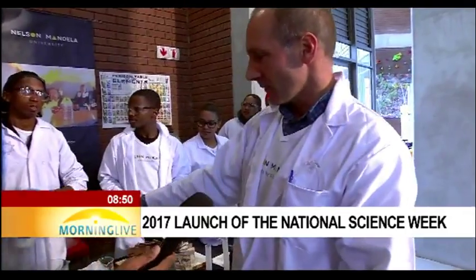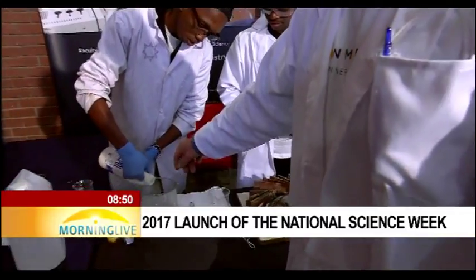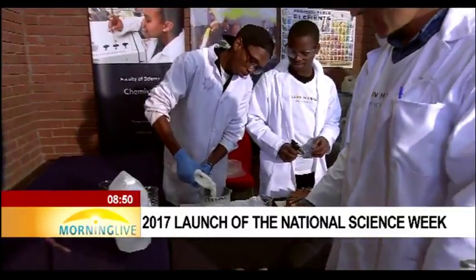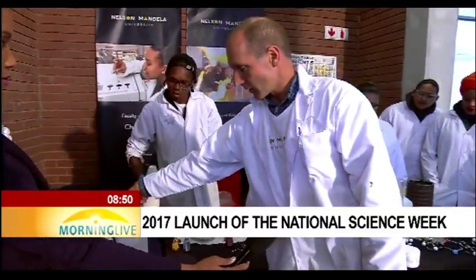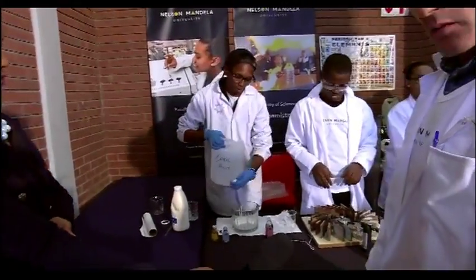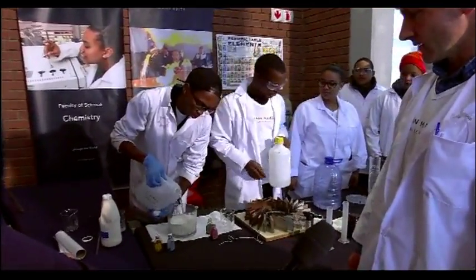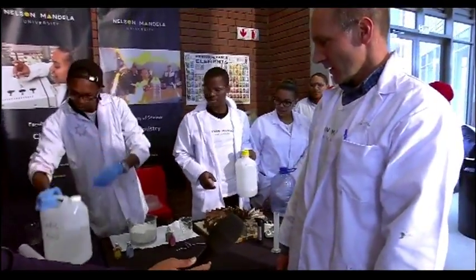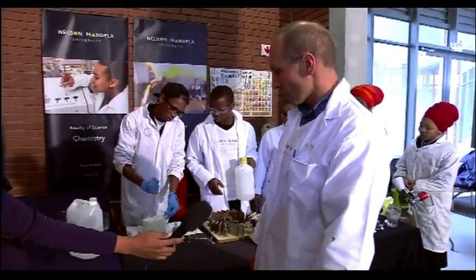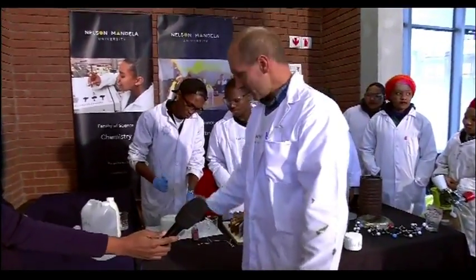Let's go to our first reaction over here. Seethle is one of our students in polymer technology. He's putting in some latex. Right, liquid latex, it's stabilized with ammonia. And in this bottle, he's got citric acid. He's going to add some citric acid to it, and let's see what happens. Go ahead, Seethle. He now stirs it up. The ammonia is alkaline, or basic, and it reacts with the citric acid. If you look closely, we can see that it's starting to thicken.